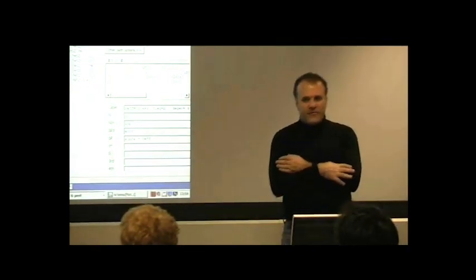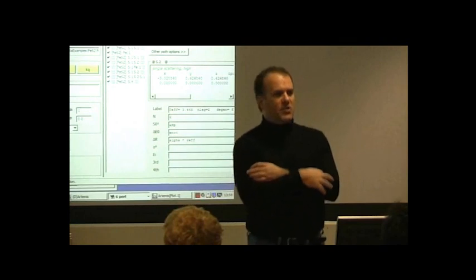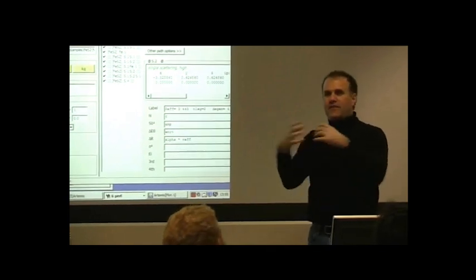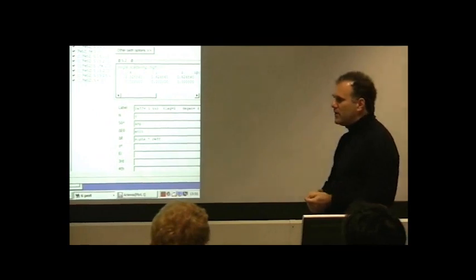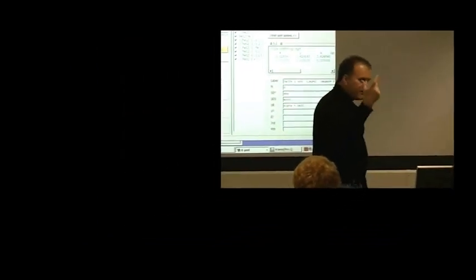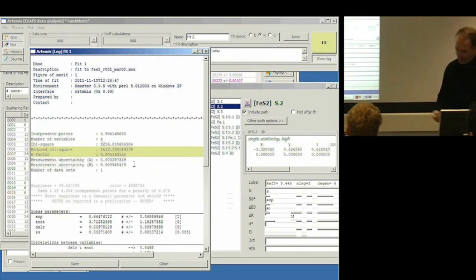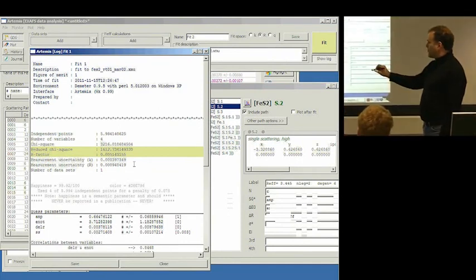Sigma squared is the tough one, and I don't really have a cute trick to use for sigma squared. Right? I was able to talk away all of the other parameters by thinking about what I know about the material. And I can't really do that for sigma squared. So, right, the nearest neighbor will have some sigma squared, and in fact we've measured that once already. The nearest neighbor had this value for sigma squared.